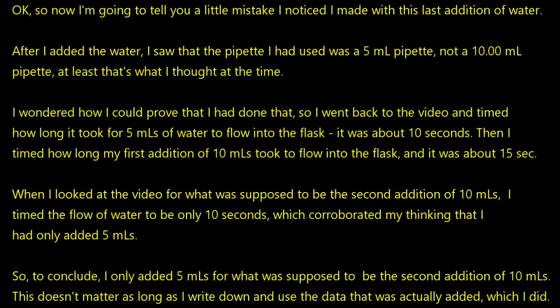So to conclude, I only added 5 milliliters for what was supposed to be the second addition of 10, but this doesn't matter as long as I write down and use the data that was actually done, and that's what I did. So it's all going to be fine, and if that happens to you, just make sure you write it down and just don't ignore it, okay?